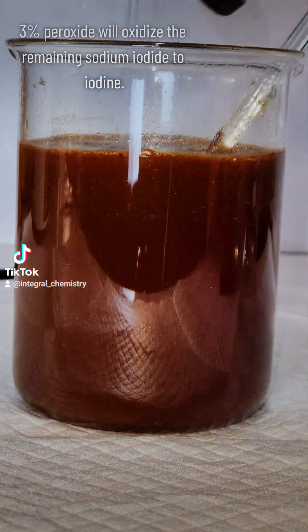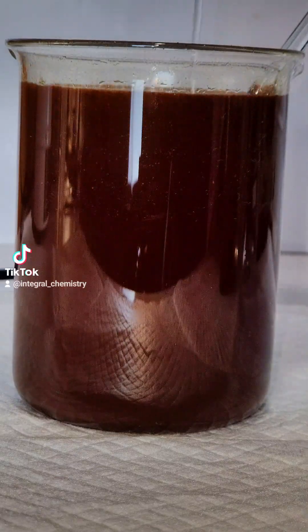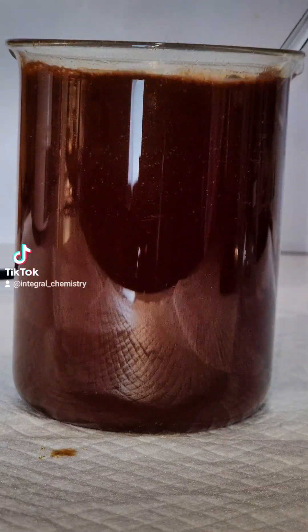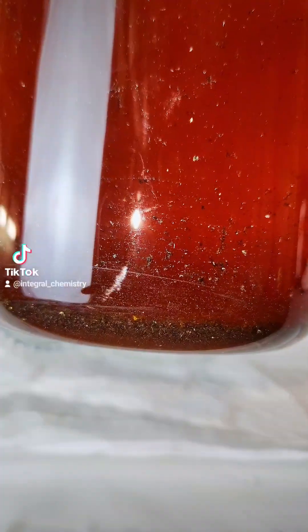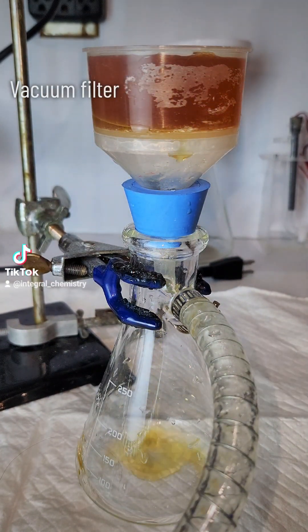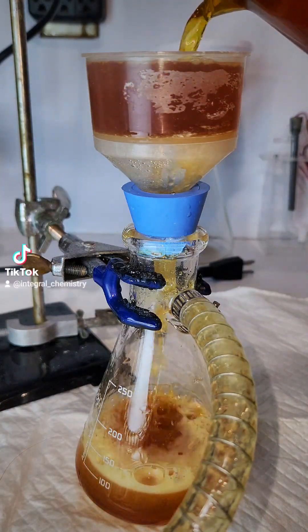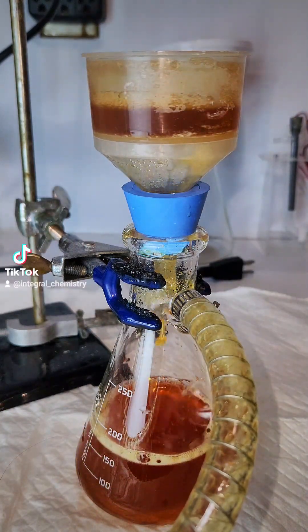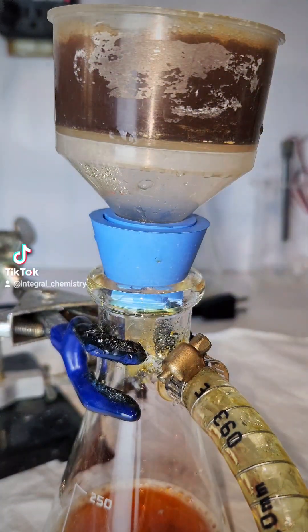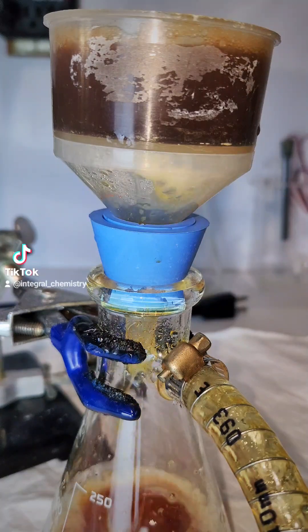Once that's cooled down a bit, I add a good bit of 3% hydrogen peroxide to oxidize all the remaining sodium iodide to elemental iodine. This is allowed to sit for a few hours to allow all of the iodine to settle to the bottom. There are a lot of ways to get my iodine out, but I find the best to be vacuum filtration. This not only is fast, but it also allows me to pull a vacuum on the iodine and get it as dry as possible before the final purification step.